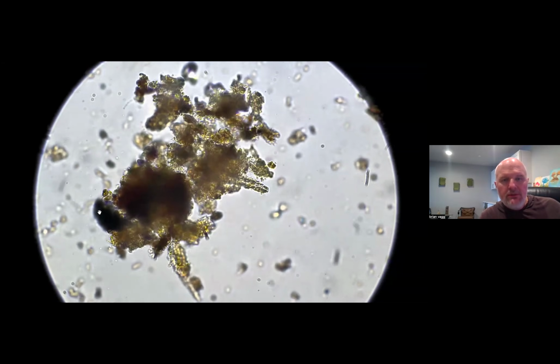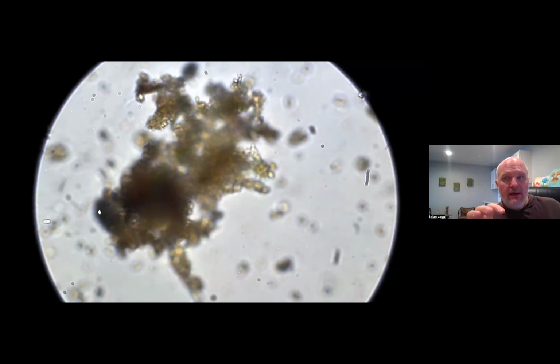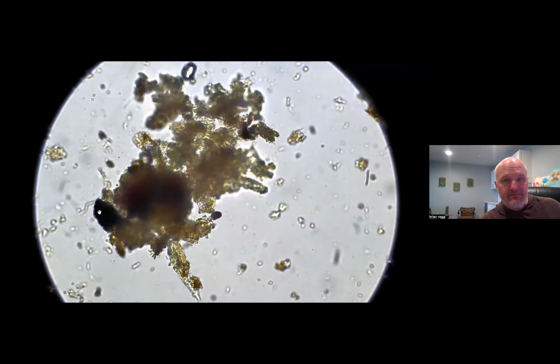So it's really important when you use the microscope not just to be static or just look at one plane of focus. You want to make sure that when you get to a field of view, you move that focus up and down through that sample, because you can see a lot of things just by going through the focal plane that you could have easily missed.